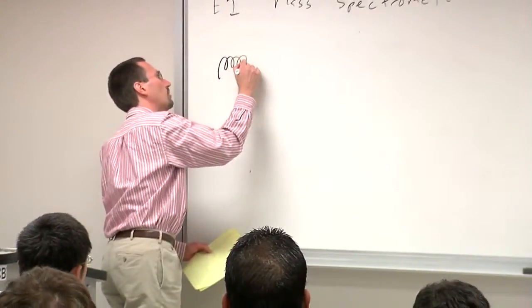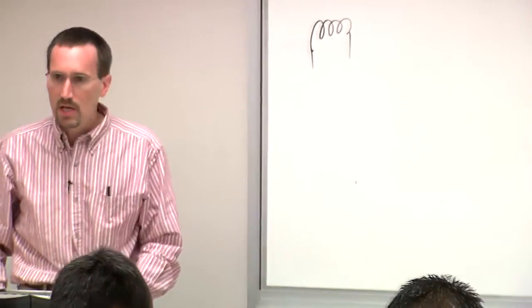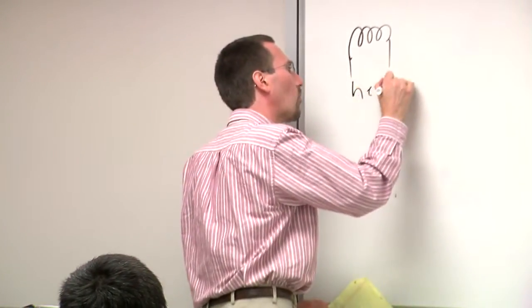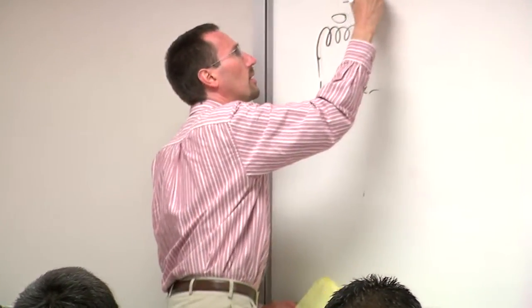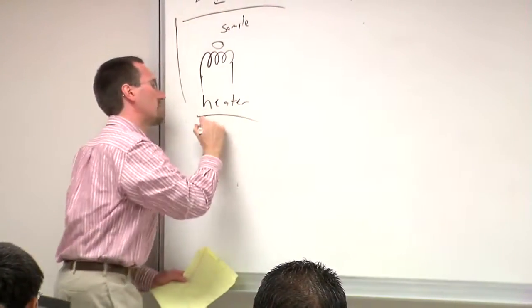So the first problem is, how do you get the molecule into the gas phase? So typically what you do is you have a heater, a coil of wire like a filament, and you put your sample on the filament, and you have this in a vacuum.